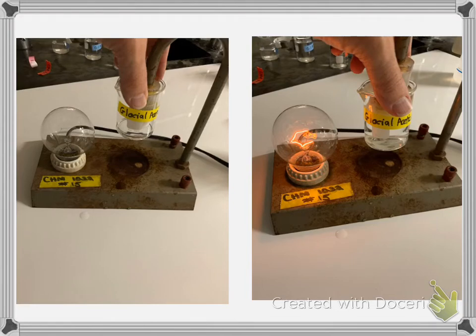And then finally, and this is really my favorite one to do in class, this is 0.1 acetic acid, and this one is glacial. Whoops, I think I have them backwards. This should not say glacial. That's my fault for the lab. I thought about it when I didn't change the label on that one, and I should have.